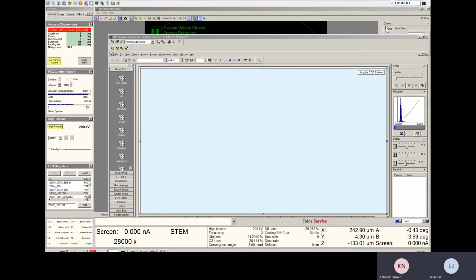Hello. Welcome back. Okay, let me show you first. Let me show you how to do nano diffraction mapping.